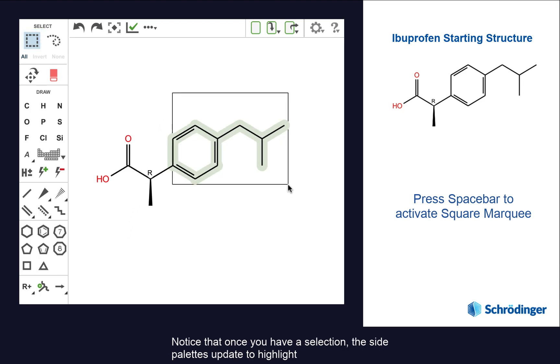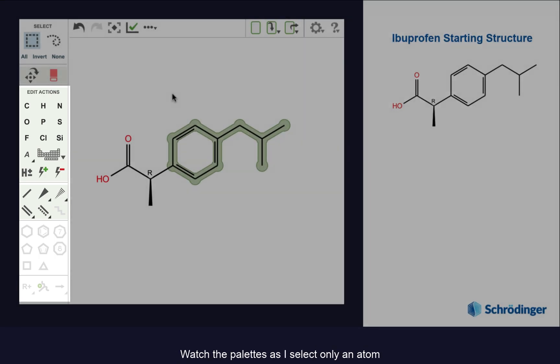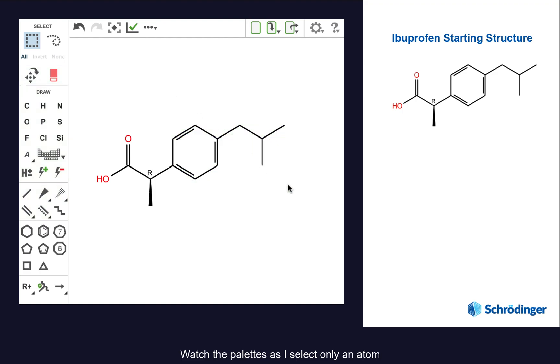Notice that once you have a selection, the side palettes update to highlight only those edit actions that can be used with the current selection. Watch the palettes as I select only an atom or only a bond.